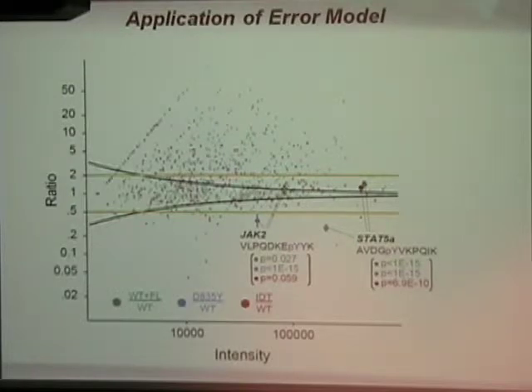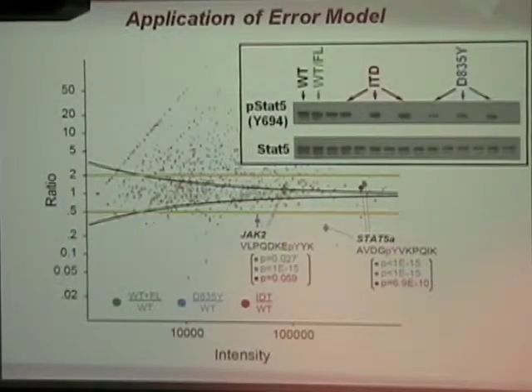Now, in practice, you're still going to do bioreps, and you're still going to go for the bigger ratios just to minimize the risk of going down an unfruitful avenue of research. But at the very least, I'm going to skip over that.